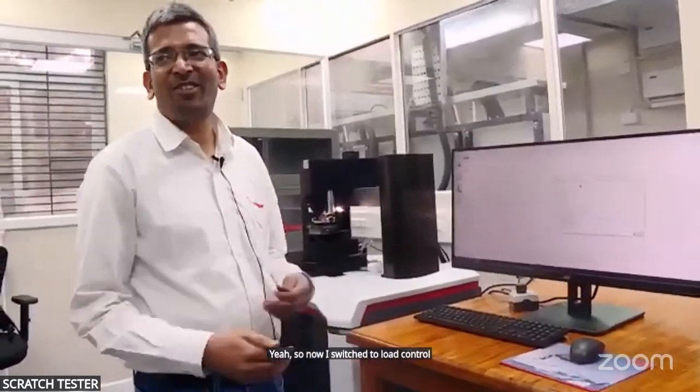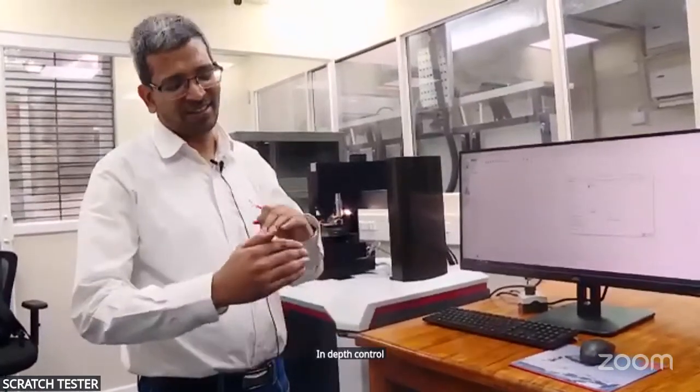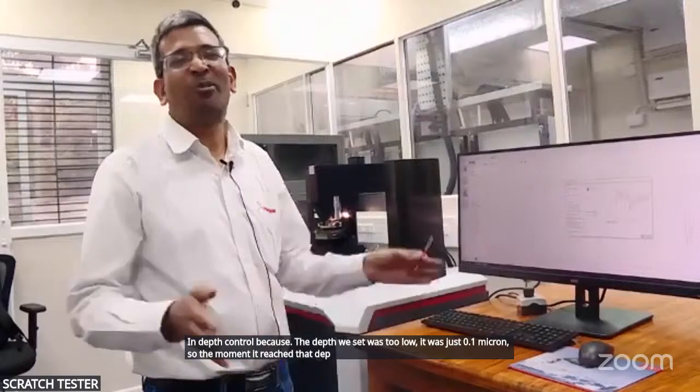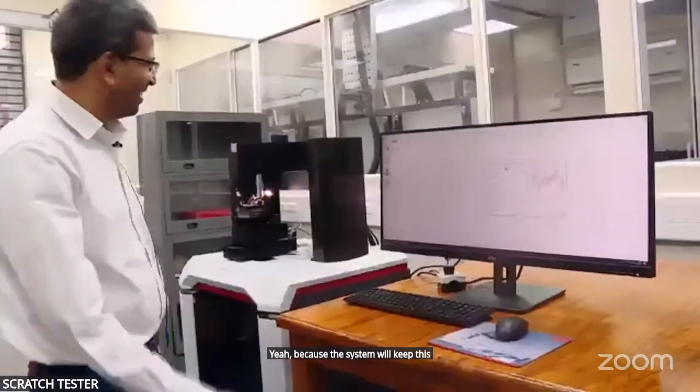I have put like 1 Newton load, so we can do this. So the issue was in depth control, because the depth we set was too low. It was just 0.1 micron. So the moment it reached that depth, it stopped the measurement, because the system will keep this penetration depth here.